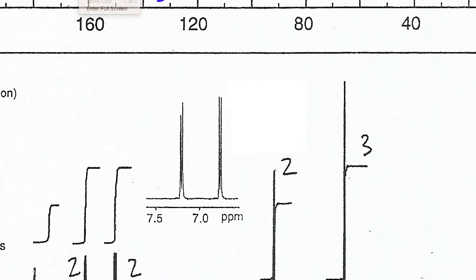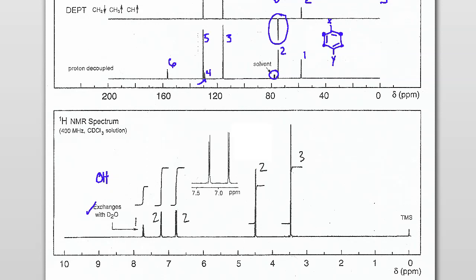All right. So zooming back out now, so we can finish this. All right, so we have the ring. We know we have an OH, so let's take a look at what we've got here. Now, down here, these are the hydrocarbons. We indeed integrate to a 2, so this is likely the CH2 portion, and we have a CH3. All right, so what we want to consider at this point is starting to put the structure together and figuring out what we're going to have and if it makes sense.